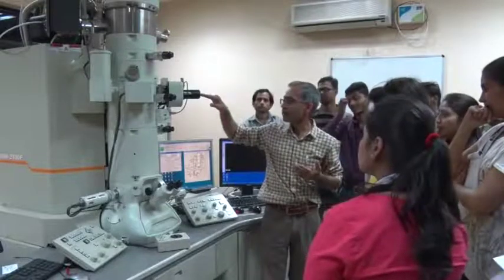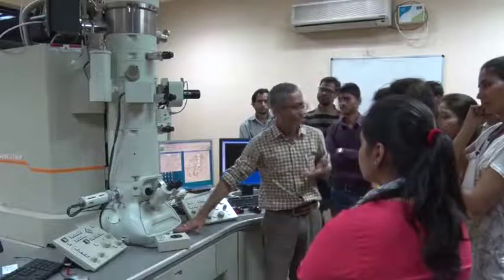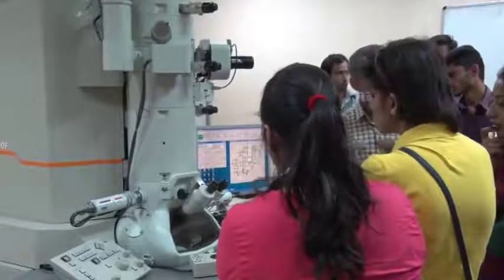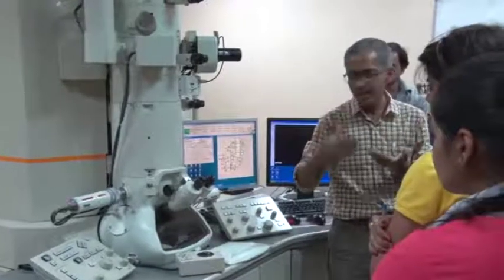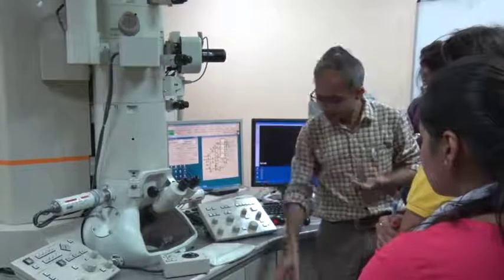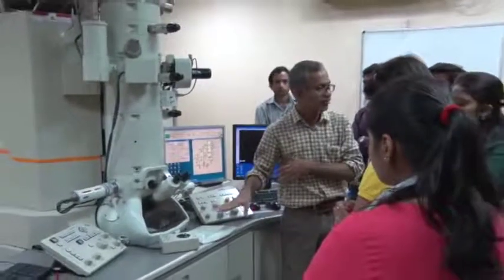One is sample and then the image, and then the image on the screen. This is the fluorescent screen, and when the electrons fall on it, they fluoresce, and that's how we are detecting it. So with the help of our eye and this screen, we will be able to detect. It is also possible to lift that screen up, and there is a CCD camera below, for digitally storing the images.